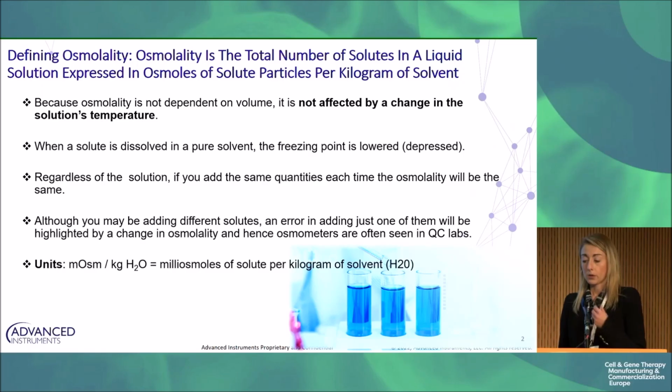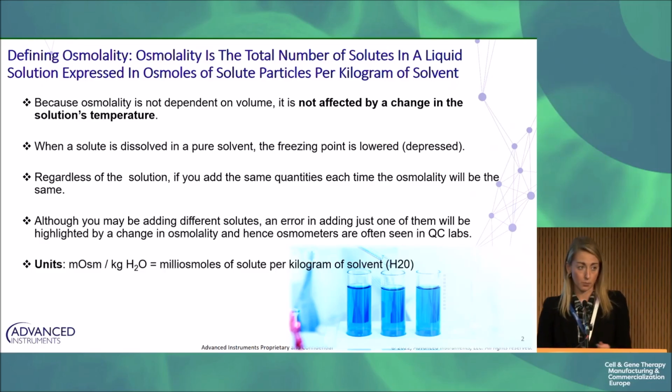Before I go into the applications, I just wanted to give some background on osmolality itself. Osmolality is a basic concentration measurement. Like it says on screen, osmolality is the total number of solutes in a liquid solution expressed in osmoles of solute particles per kilogram of solvent. Because osmolality is not dependent on volume, it is therefore not affected by a change in the solution's temperature.